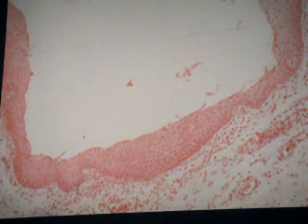Okay? Sinasabi ko lang sa inyo para alam nyo, kasi pina-identify sa inyo ang lamina propria and it's the vagina, the answer would be different, right? Kasi if it's the esophagus, this one is loose connective tissue. If it's the vagina, it is dense irregular connective tissue. Okay?